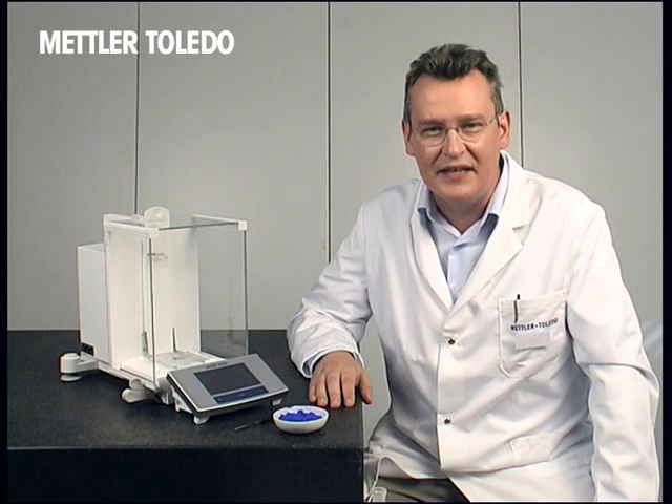Hello, I'm Julian Stafford from Mettler Toledo and I'd like to show you some of the key features of the XS analytical balance.